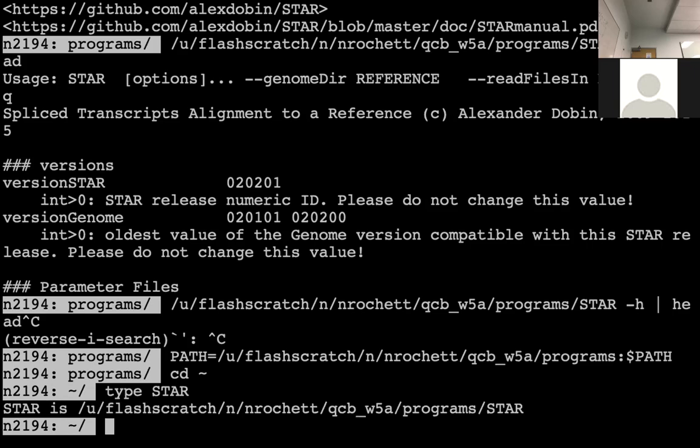But if you're typing in the command directly, I would not recommend using backslashes, because you're going to have to retype every line separately. Inefficient.